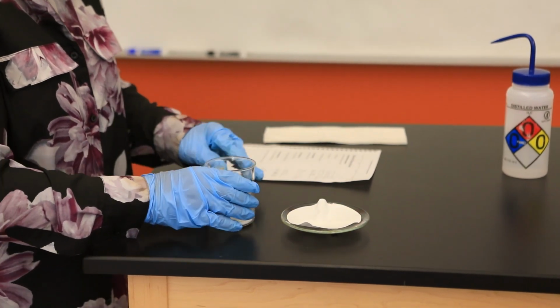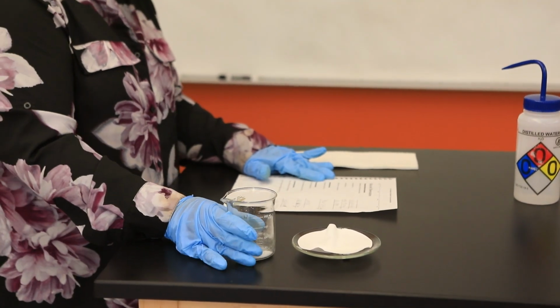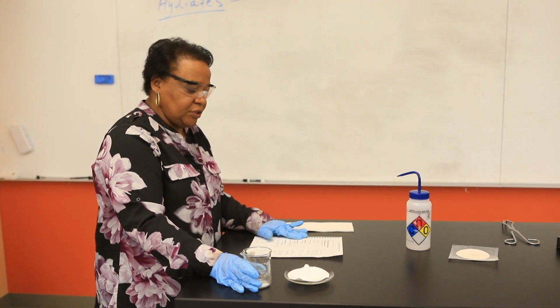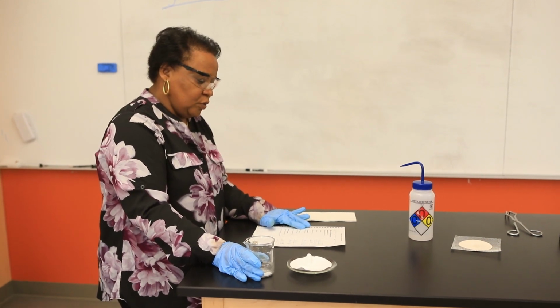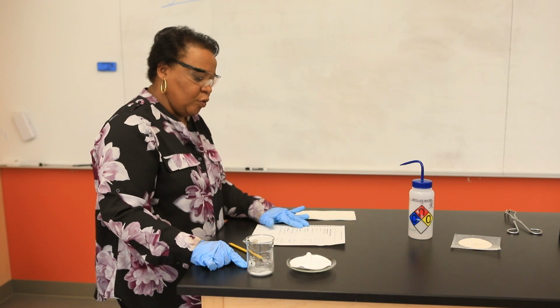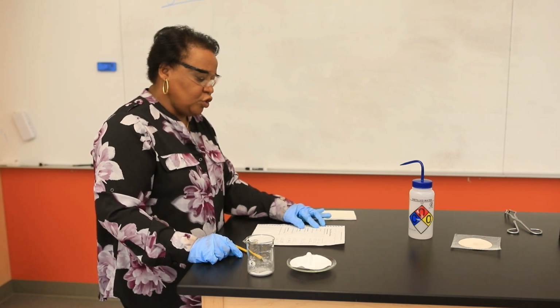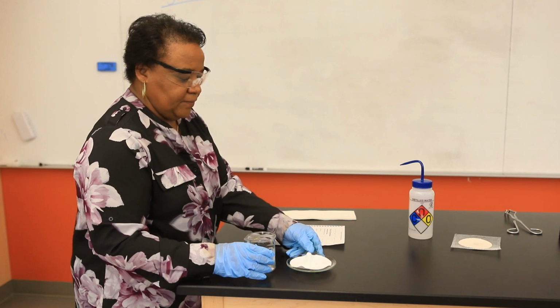And so here is the final data that you need to record. The mass of beaker, this is now beaker number 2, with NaCl is 94.334 grams. If you recall, you know the mass of this empty container, so you should be able, by differences, find the mass of that salt.